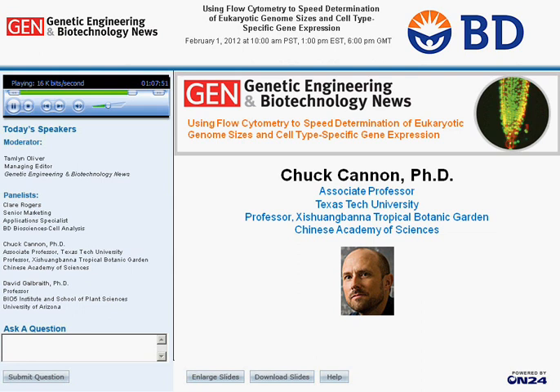But there is the staining step. And so there are a few things, the sample doesn't immediately go into the machine. But you can process quite a few. And I think David even had some statement. I don't remember what it is.